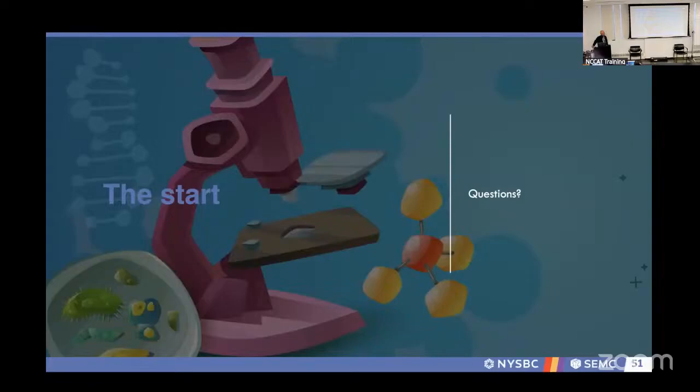And also you mentioned there are different detectors that can collect. Well, with the same sample, you can collect on different setups. Something that we have here is the ability to collect on an Alpine, a K3, a Falcon, with and without a filter, with and without a cold FEG.